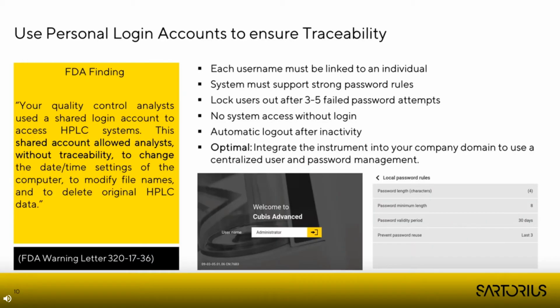Our first example from an FDA warning letter shows why user management and personalized user accounts are so important. In this case, an analyst worked with a common user account or shared user account, so it was no longer possible to track who generated the data or made changes to the system settings.